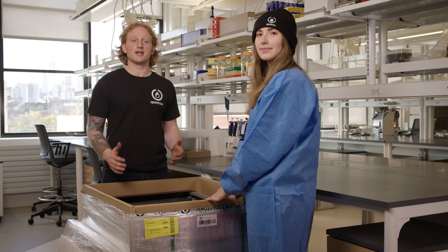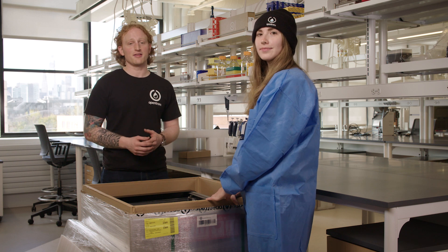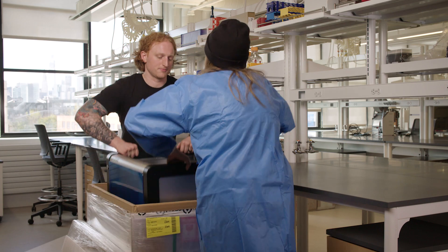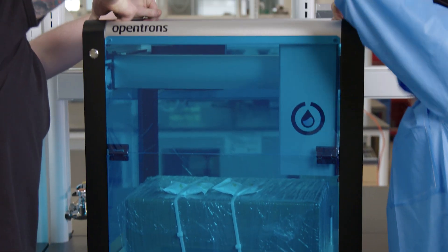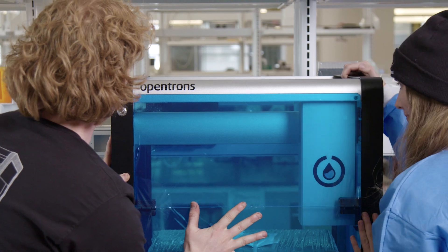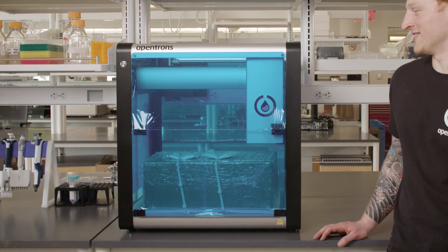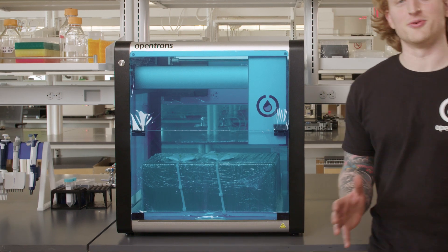I will need help lifting the OT2 out of the box and onto the workbench. Here it is, the OT2.